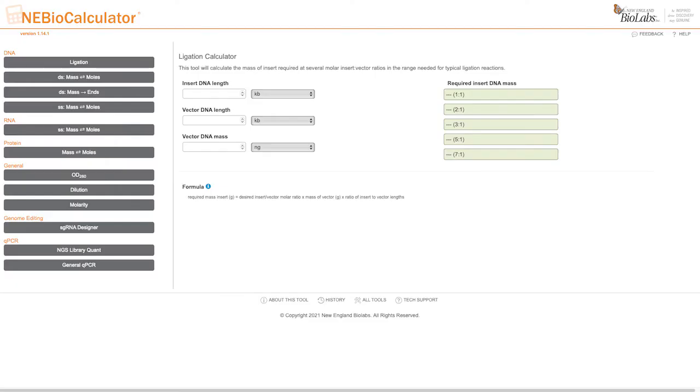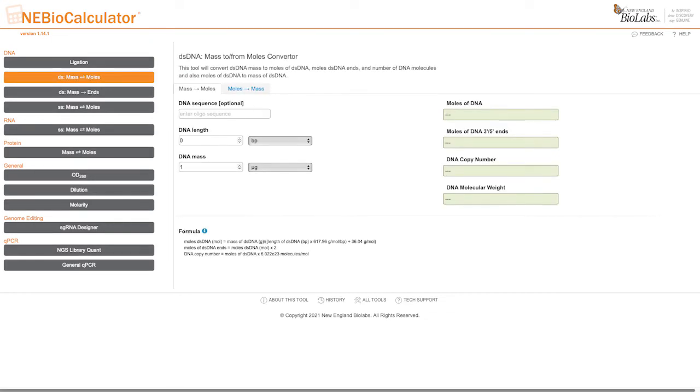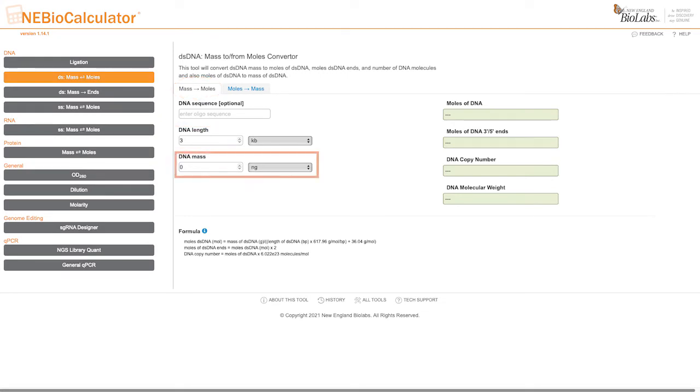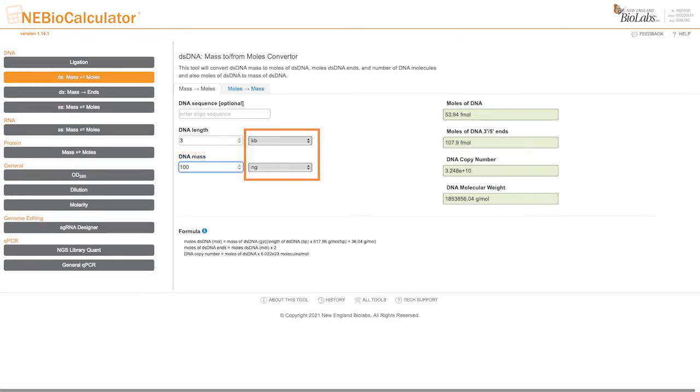We will first determine how much of the vector should be added to the assembly reaction. Start with the recommended 100 nanograms of vector. To begin our calculations, click on the double-stranded DNA mass to from moles conversion button. Click on the mass to moles tab. Enter 3 kb for DNA length and 100 nanograms for the DNA mass. Make sure you select the correct unit type from the pulldown. NEBioCalculator tool immediately calculates that the number of moles of vector is 53.94 femtomoles or 0.0539 picomoles of vector.